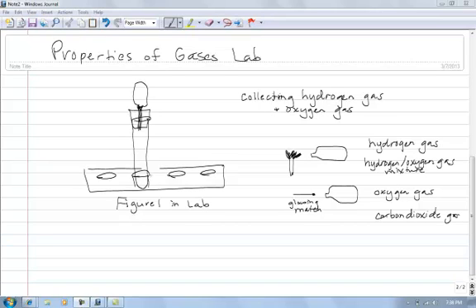Also, they have you use tissue paper, Kleenex, or napkins to shove down in here to make sure it holds the test tube upright. Down in here is where you're going to be putting that tissue or napkins to wedge it in there tight. It's going to take quite a while to generate this whole tube full of hydrogen gas.